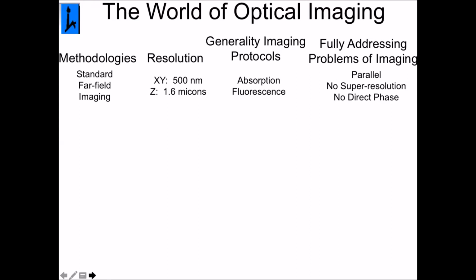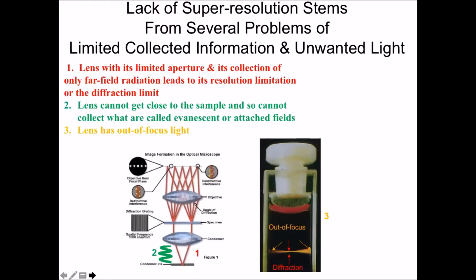So now we go on, and we see how we can improve what an optical microscope can do. Now remember, there are 3 different things that the optics really is limited by, okay? The wavelength of the radiation is a resolution limit, which is called the diffraction limit, okay?